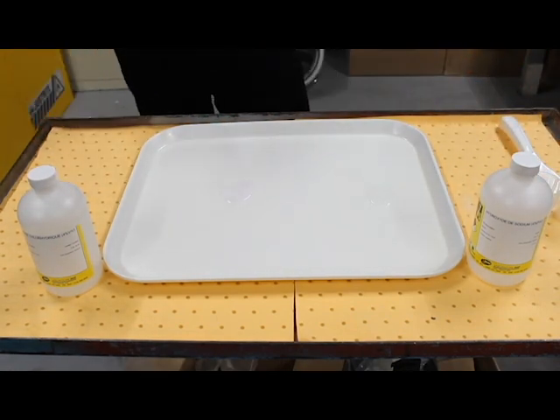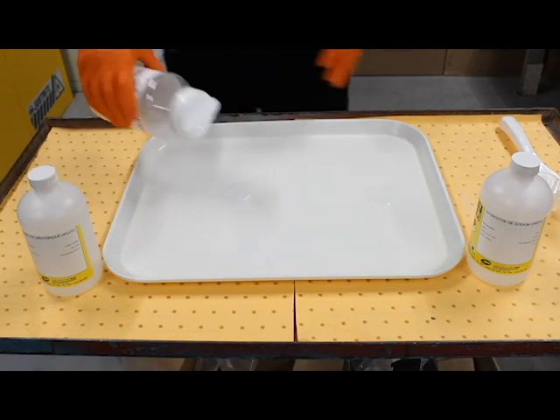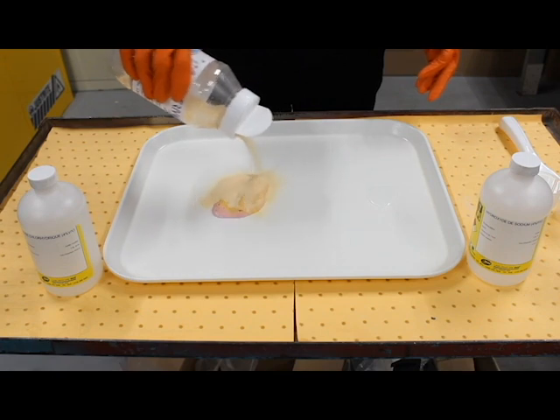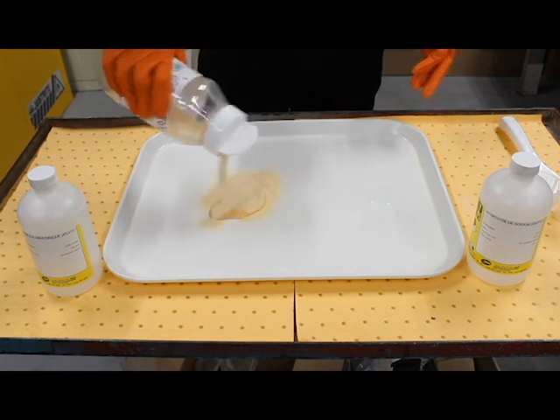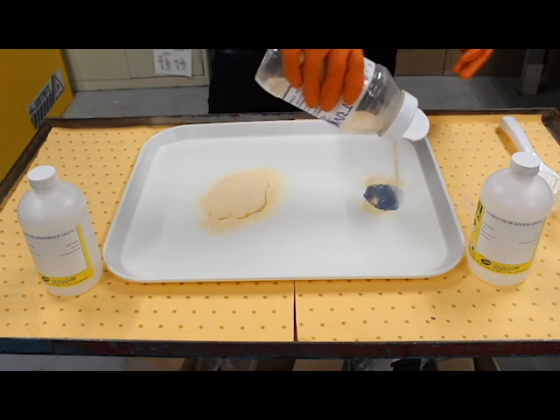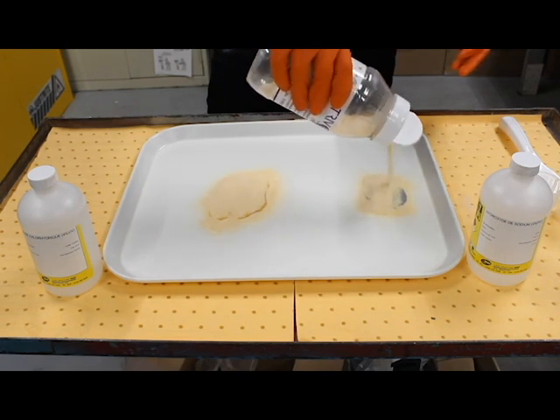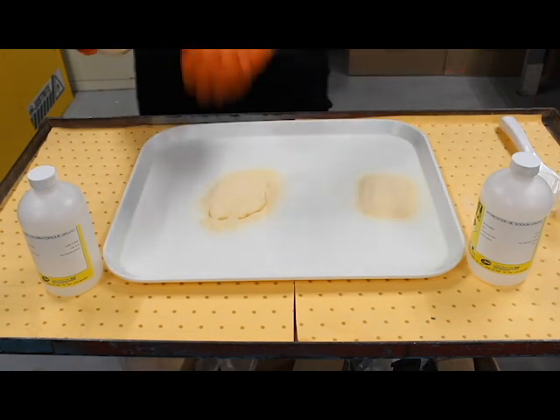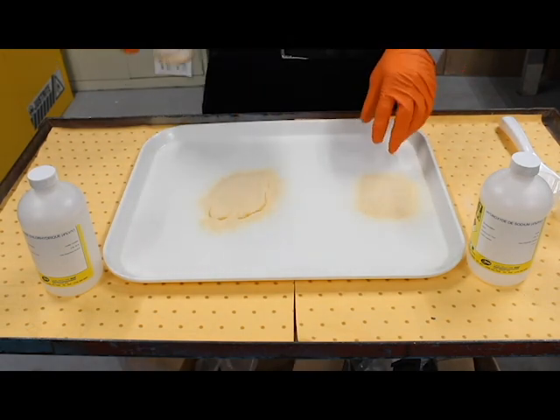Now I'm going to take my Turborex and just quickly go over top of each one. You'll see this one turning pink, which tells us automatically that it's acidic. Going over top of the other tells us automatically that we know it's a base. So I know this is my hydrochloric acid and this is my sodium hydroxide.